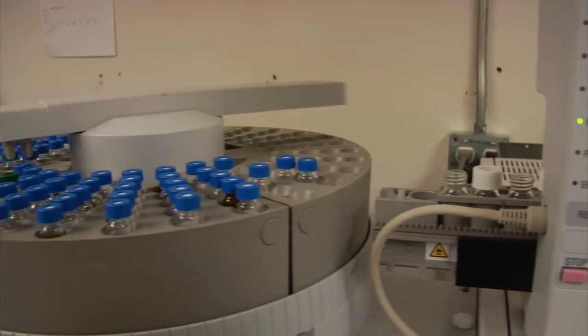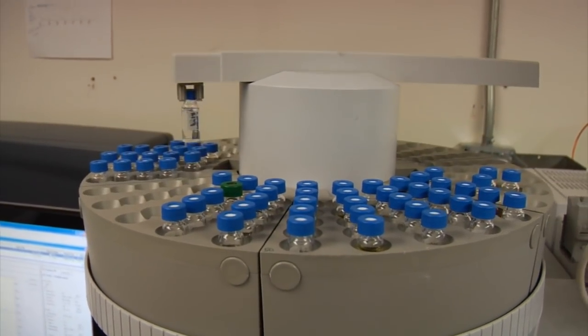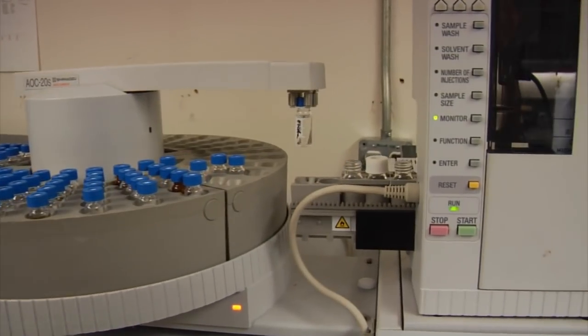The amount of response from the detector is proportional to the amount of cannabinoid that is present. So when you measure with liquid chromatography, you need to correct for the weight loss that will happen when CO2 dissipates upon heating of the THC acid.